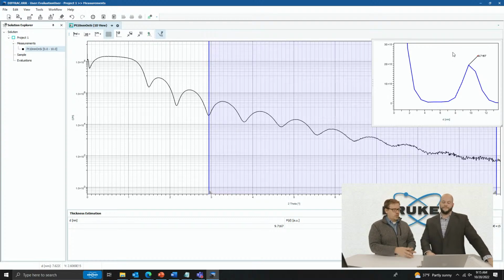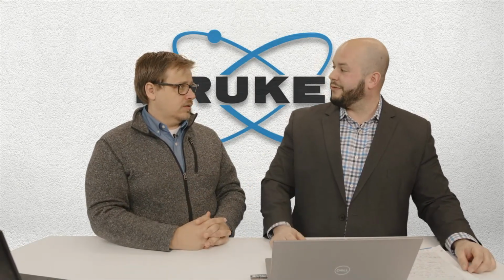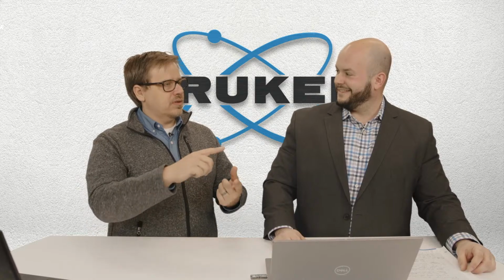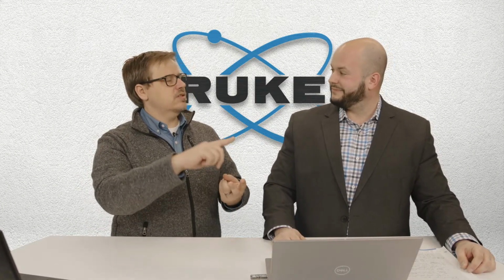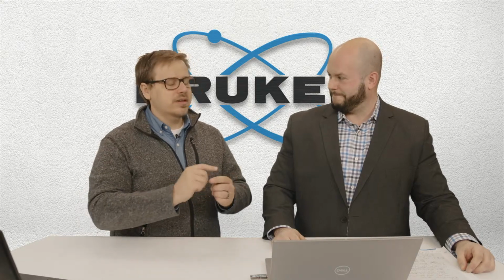Would this only tell you the one frequency? What happens if I have two layers? Then you would see two peaks in the Fourier transform, or three, correlating to the addition of those two thicknesses. Yeah, three, because you would have the thickness of layer 1, the thickness of layer 2, and then the thickness of layer 1 plus 2. That's right. We'll see that in later examples too, if we have time.